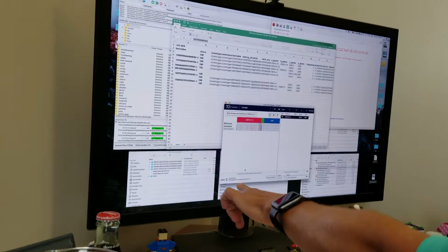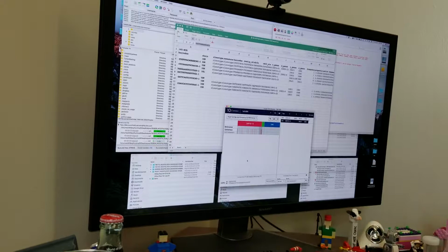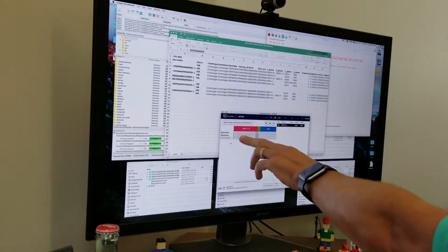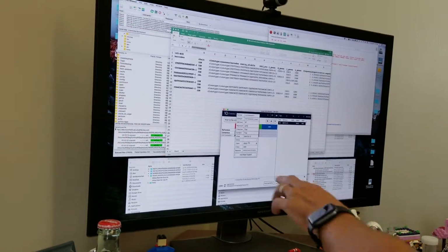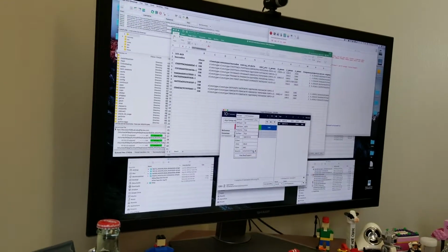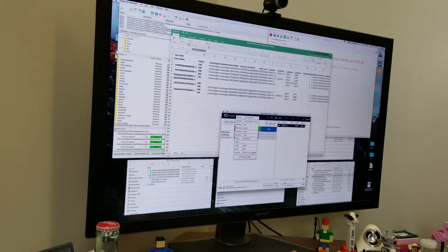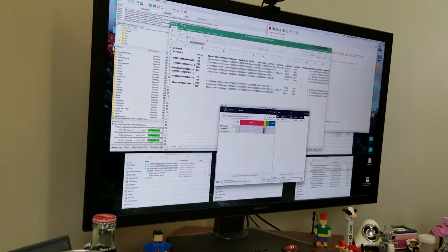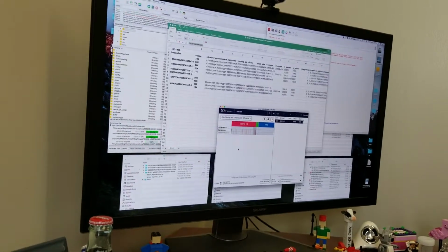And now here is this sequence for the heavy chain and the kappa chain, and the nucleotide sequence and amino acids are right here. If you need the entire consensus sequence across the entire region, you can come up here and hover over this, and then you'll see that the sequence is listed right there, and you can just click on it and it will copy it, and you can paste it into Word, Excel, whatever you want. But you have both the heavy and the kappa and their respective sequences here.